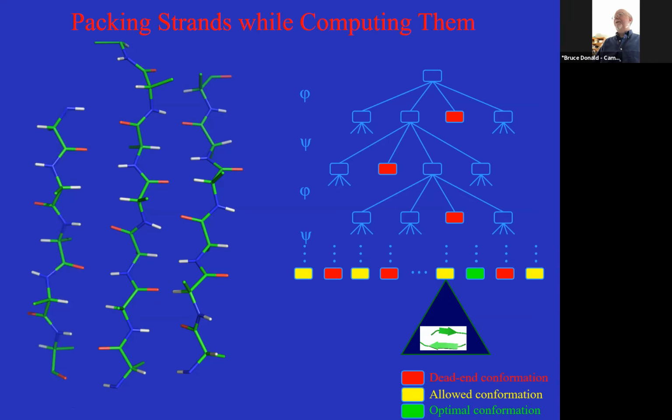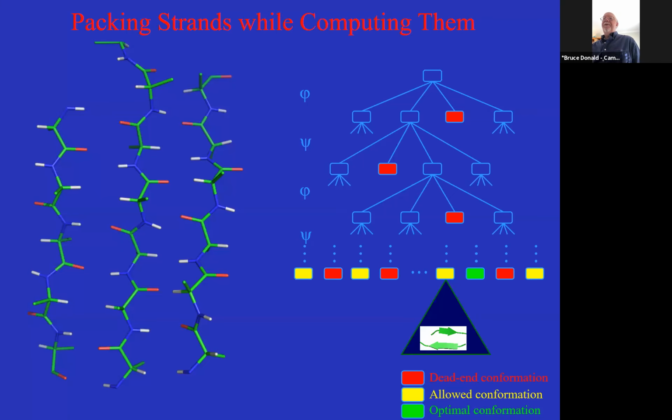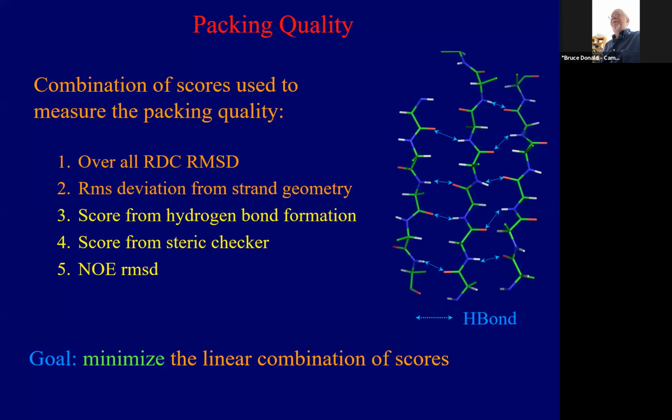We were able to get out decent solutions there. So we're basically taking into account the beta sheet geometry in order to extend this. So I guess one way to think about this is as a project. Suppose you're working after someone in a laboratory doing this, or you're looking for a course project, and it's been shown that you can pretty easily compute secondary structure elements consisting of helices, and you could actually compute some strands, but packing them together tends to be more complicated. What do we need to add to the algorithmic process?